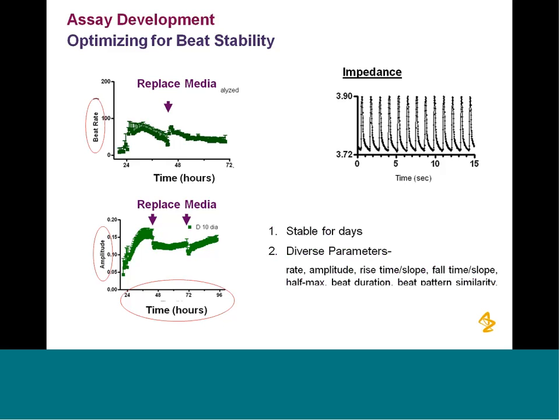But overall, our experience was that the beating was stable, and I've only shown you amplitude and rate, but you can extract a number of other properties with the ACEA software. We wanted to look at the data in some specialized way, and we got xCELLigence to help us add some new features to that. So if there's something that you don't see here, our experience has been very good in getting ACEA to work with us to help us refine what we want to get out of there.